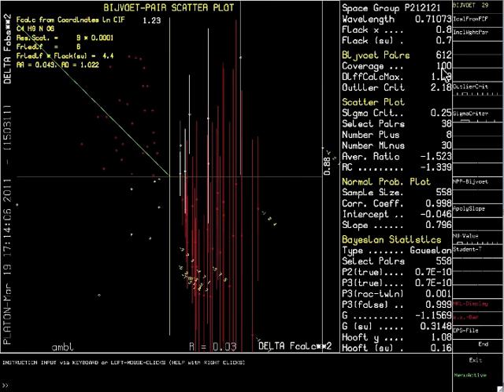Platon shows the size of the observed Bijvoet differences and a comparison with the calculated values in the scatter plot at the left. We will not go into details to explain this graph here.